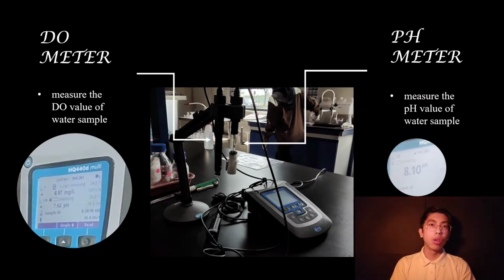When we use the DO probe, the screen will show two values: the DO reading at the top and the pH value at the bottom, as we can see in the slide. When we use the pH probe, it will only show the pH value of the water sample.